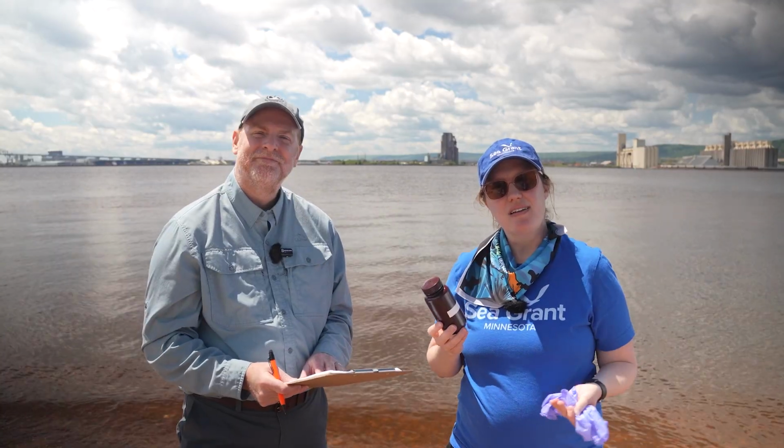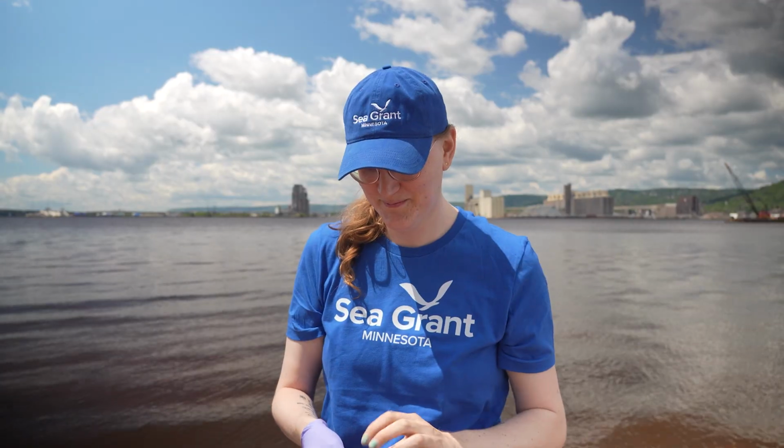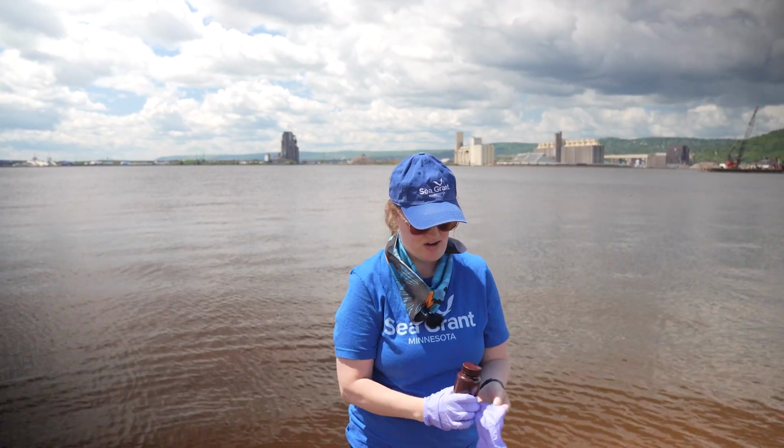Okay, so now we are going to show you how to actually collect your water sample. Wait! Don't forget to put on your gloves. Right. I do not want to come in contact with a bloom, so I am going to put on my gloves. Thank you for the reminder.